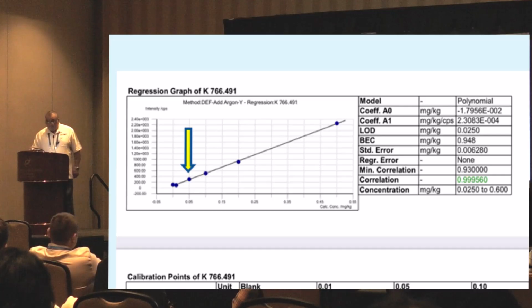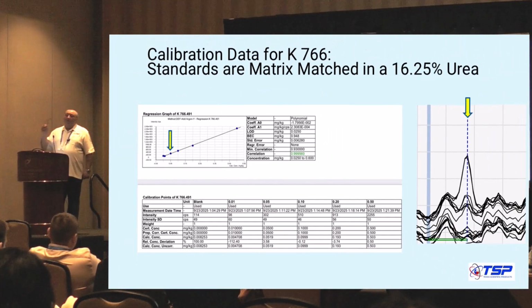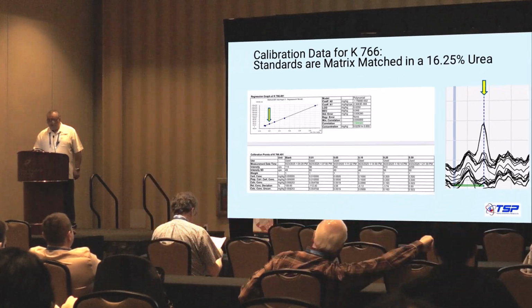Here is an example from one of our customers done in urea, and you see 50 ppb potassium, so you get 0, 10, and it's kind of at the same level, but this is a 50 ppb spike of potassium, and potassium is one of the most difficult elements to handle here because of the carbon-related bands. So people can also introduce oxygen to burn it, to make it better. But here is what can be done with all this setup and this nebulizer. So here is the 50 ppb point on the curve.